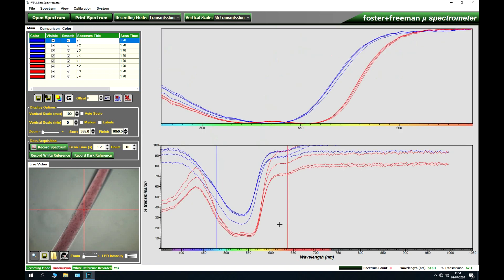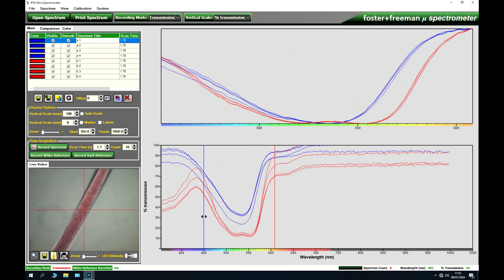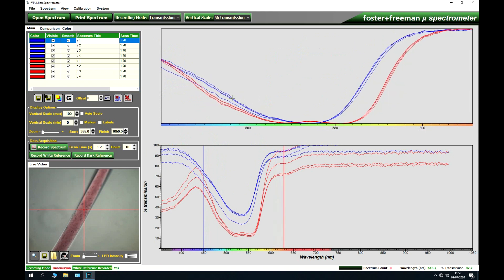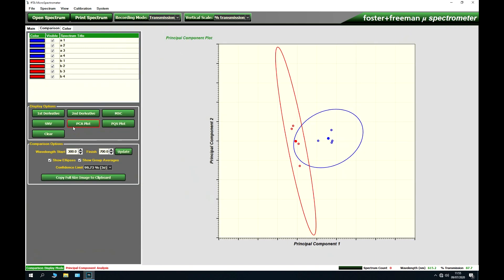One way to display the differences more clearly is using the zoom window, where we can see slight differences including a double peak on the red spectra and a difference in absorption or transmission ranging up to 600 nanometres. Using the comparison tab, the PCA plot of the two spectra shows that at three standard deviations the ellipses are not overlaid on top of each other, indicating that the fibres are of a different colour.